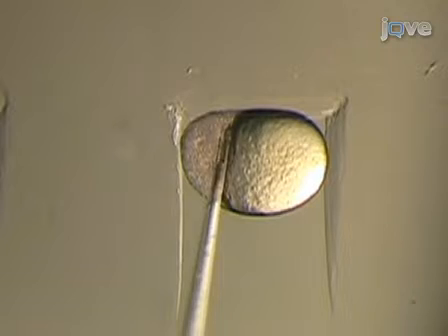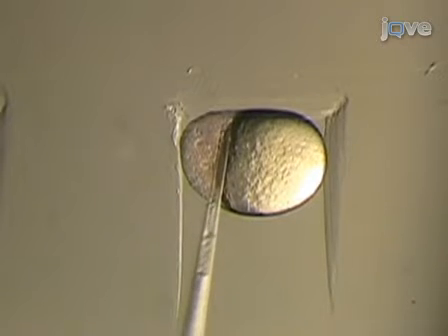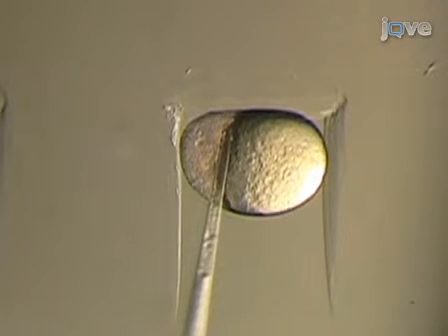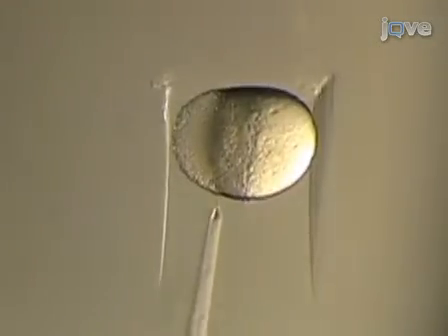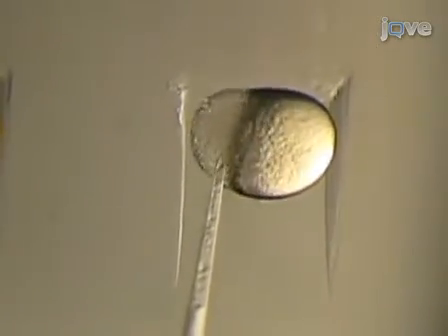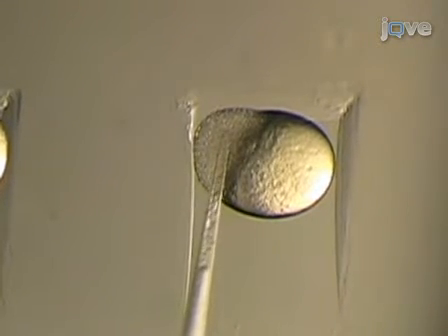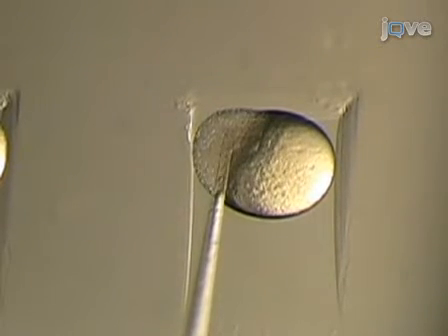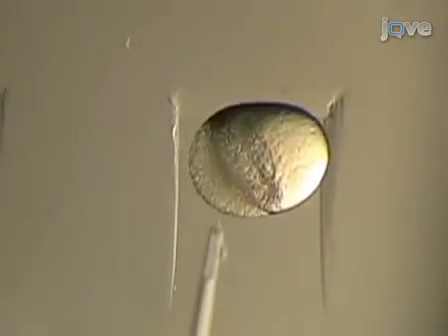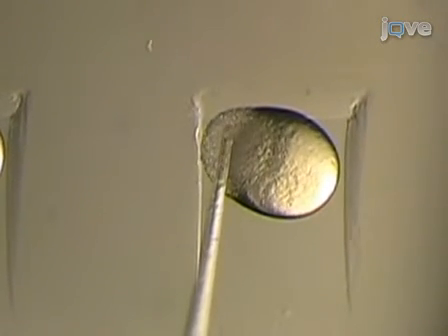And you have to pick them up very gingerly so as not to accidentally start sucking up the yolk. Okay? And so that's what I've done there. And now I'm moving to a host embryo. Now the primordial germ cells will home into the genital ridge region of whatever embryo they're in. So there's no need to transplant these primordial germ cells to the margin. They'll get there themselves. So I'm just transplanting, putting them back in any old place into the host embryo.